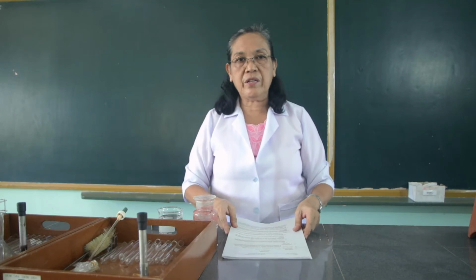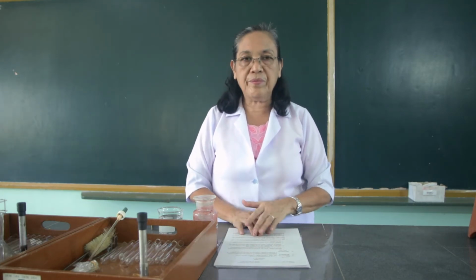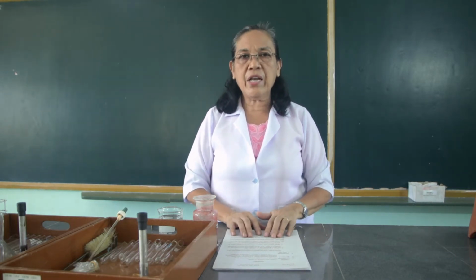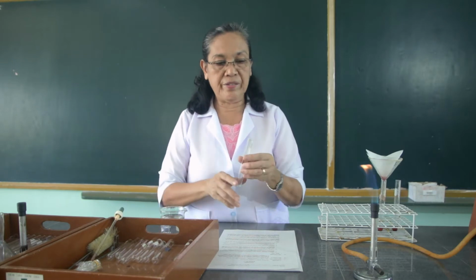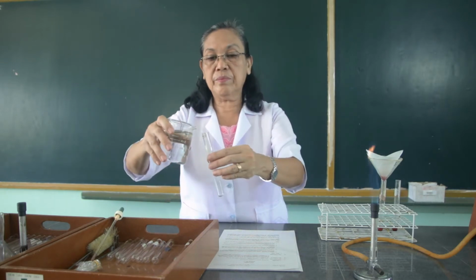For the next procedure, we are going to boil 10 ml of water and into which we are going to dissolve a gelatin. And I would like you to observe what happens to the gelatin. So we will boil 10 ml of the water in this test tube.